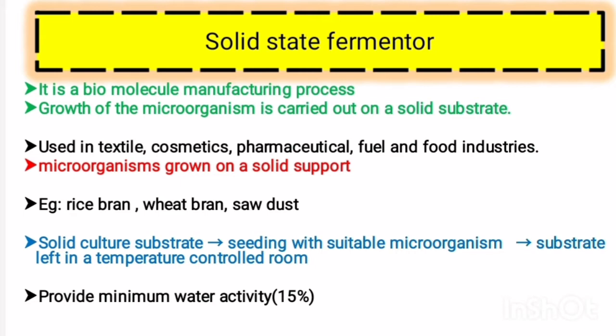Some fermentation processes do not involve a liquid medium. For this process, the growth of the microorganism is carried out on a solid substrate. That is, microorganisms grown in a substrate with little amount of water or in the absence of water. About 15% water is required for the solid state fermentation.